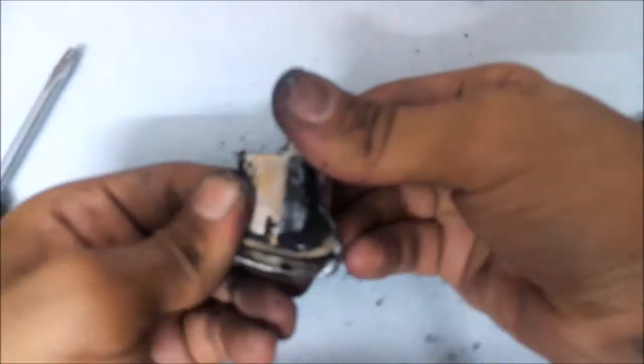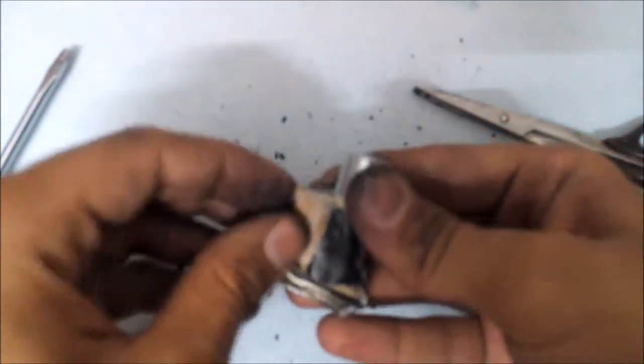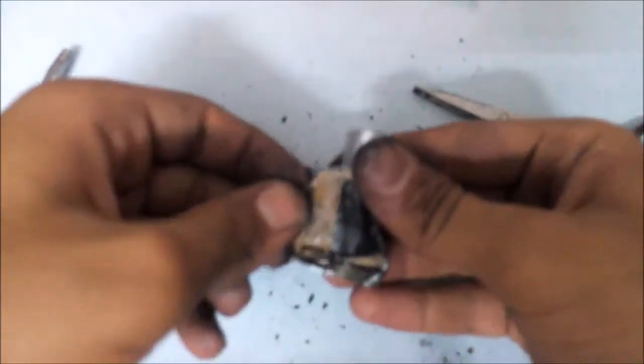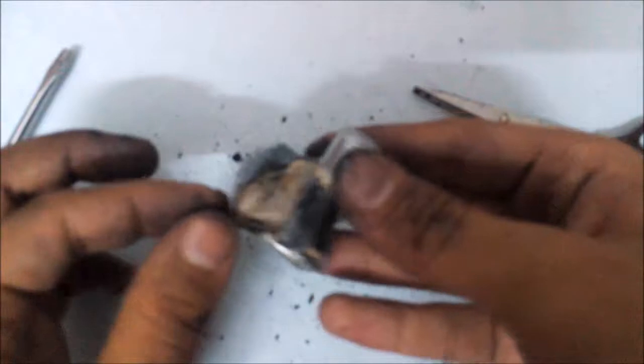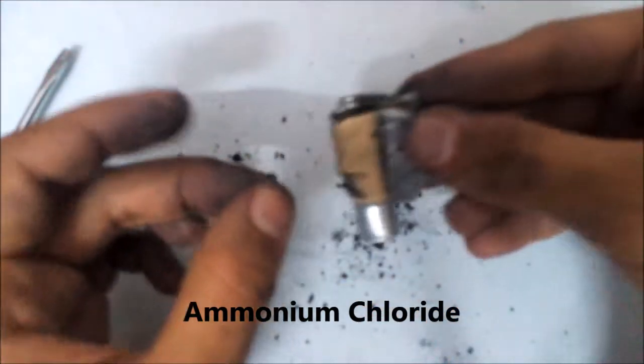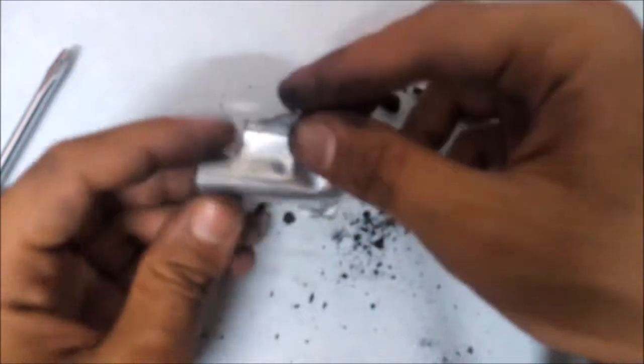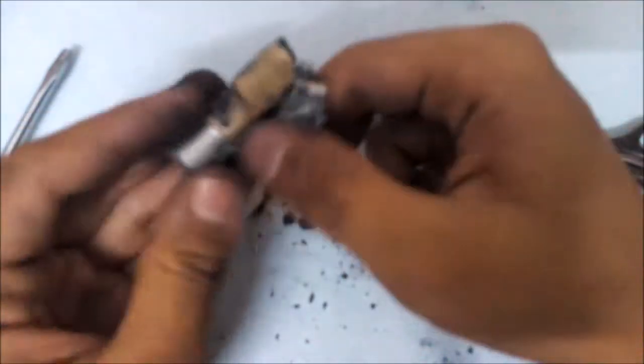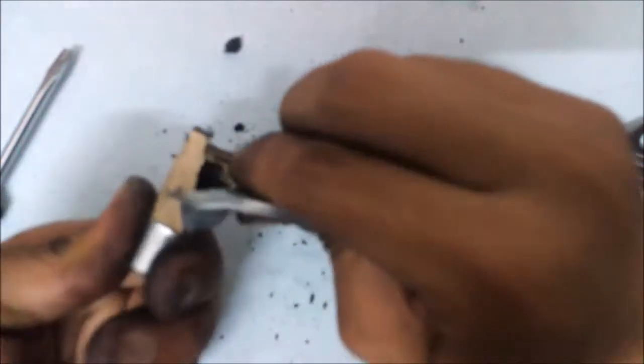Now just see what lies inside here. Below the metal casing you can see a brown color paper. This is a little wet because of the chemical which has been soaked in it, that is ammonium chloride. We cannot extract ammonium chloride from here, so the outer metal casing, the zinc metal, is one of our important chemicals. We can keep this part aside and discard this paper.